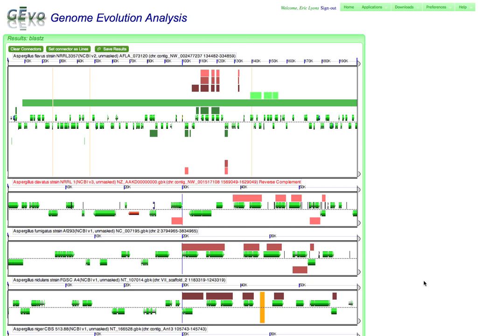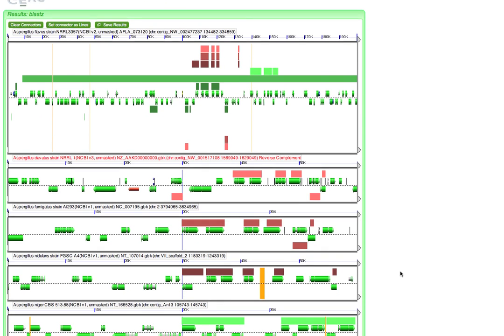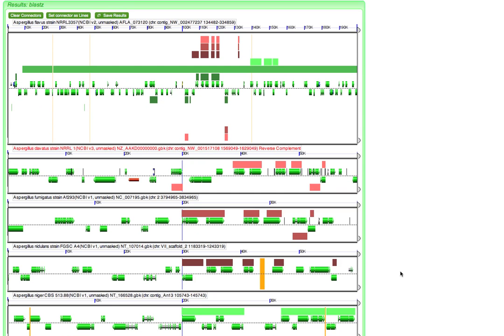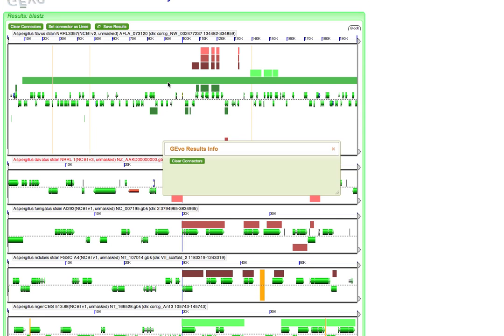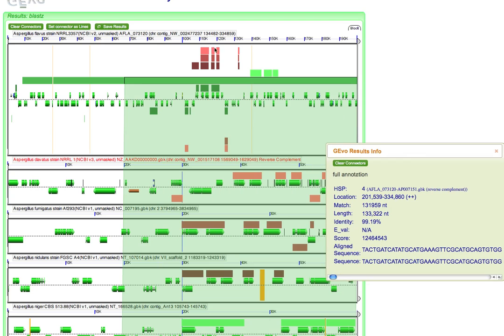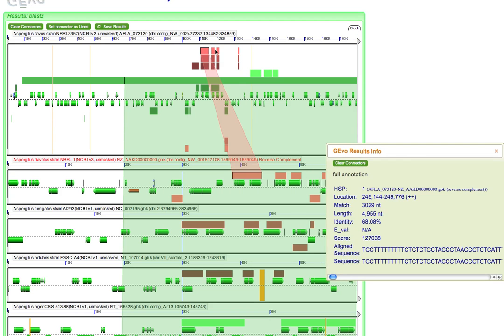For this example, we're taking a look at approximately seven regions from different fungal genomes. Up here on the top is our reference region, and you can see that we have synteny to all of these other regions.